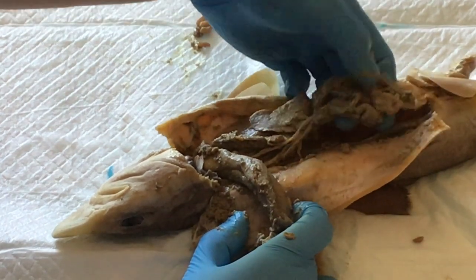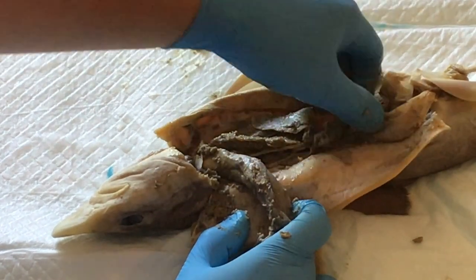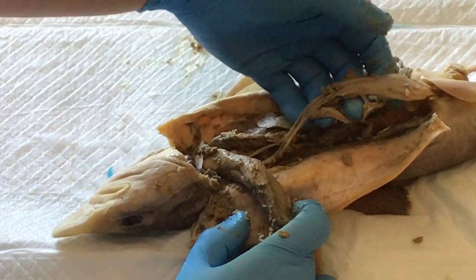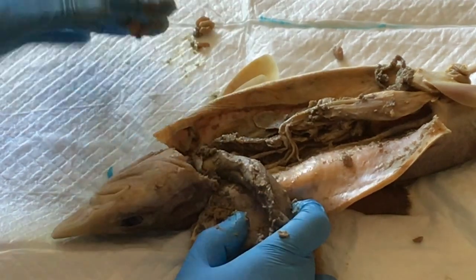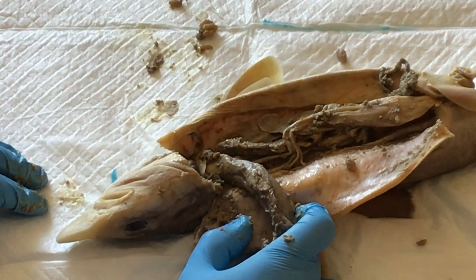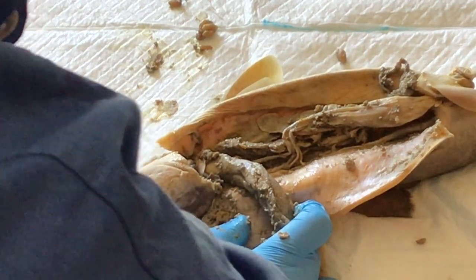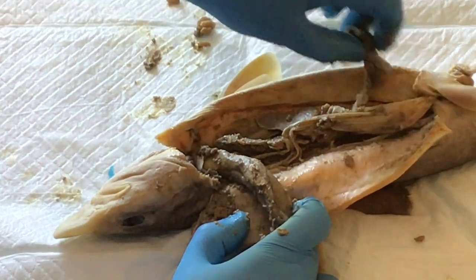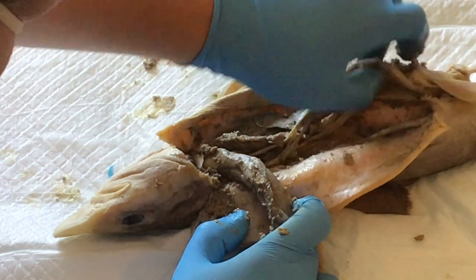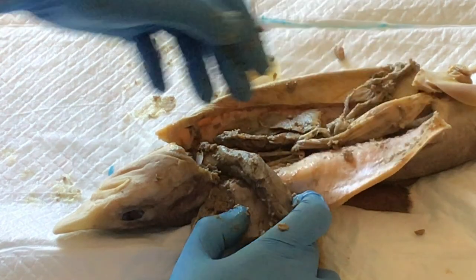Now, one thing that's going to be kind of difficult to see, and this is in such bad shape, is the stomach. The stomach here, this particular part right here, has been really damaged for some reason. Obviously, all the contents are outside, so it's kind of poorly preserved. We're not going to be able to find anything in the stomach since there's very little to see here. Part of the stomach there. This is the small intestine here, right before things leave the body.